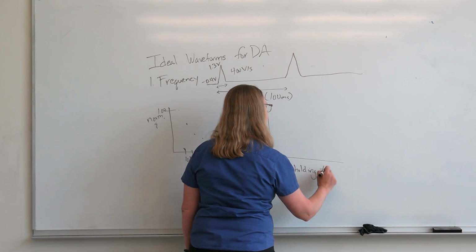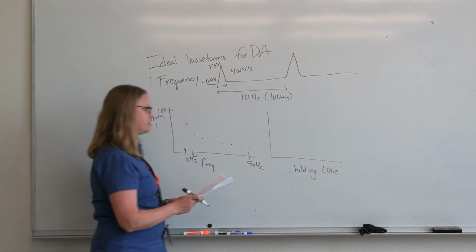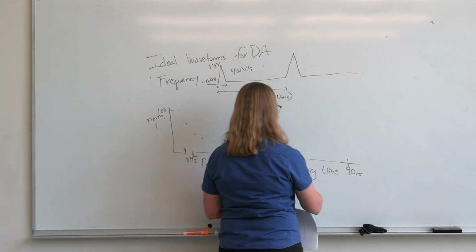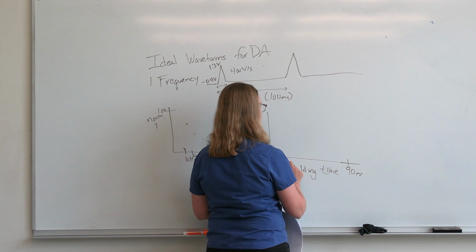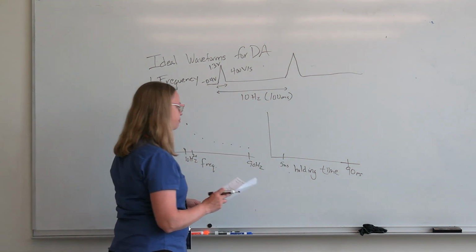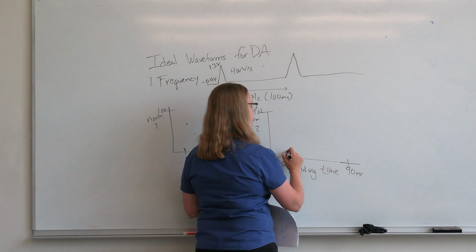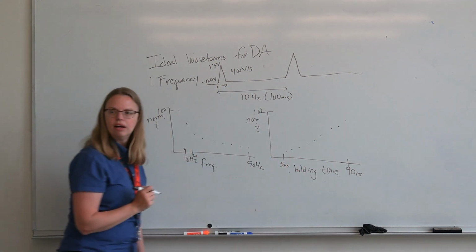holding time. And I've actually asked a student to do this for me one time. Remember that the highest holding time I'm going to do is about 90 milliseconds, and then you can get down to ones that are even like 2 or 5 milliseconds, sort of short. And then again, we're going to look at some normalized current, where I'll go back to 100. And if you did that, it actually comes out pretty linear.